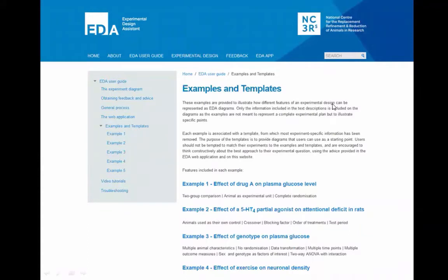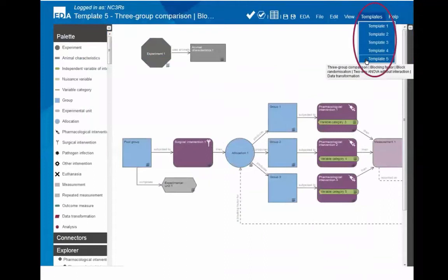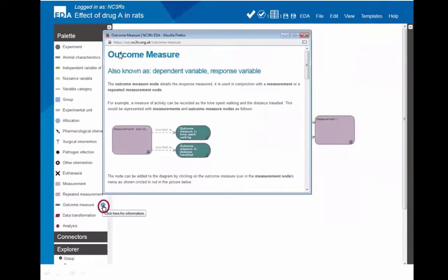If you've never used the system before, it might seem difficult to come up with your own diagram, so we've included a lot of help. We've included examples with text descriptions and corresponding diagram representations, so you can see how different features are represented. We've also included templates that you can load as a starting point and customise — removing or adding groups, interventions, and so on. And we've included definitions for each node in the palette: if you don't know what an outcome measure is, for example, you can open the information box to find what it's also known as, a definition, and common examples seen in animal experiments.